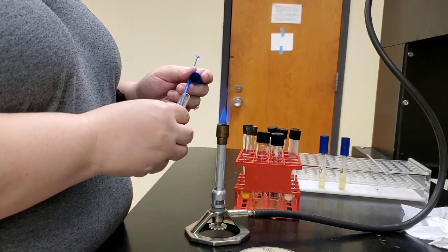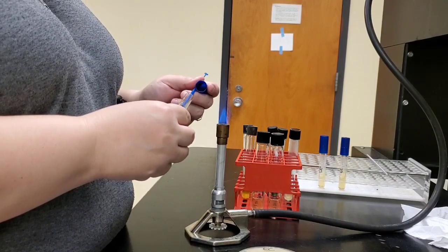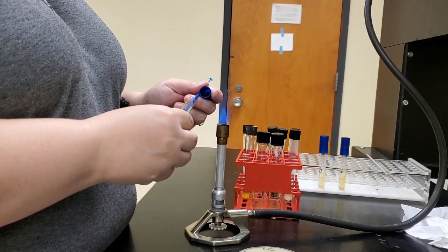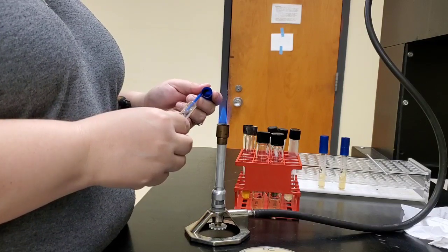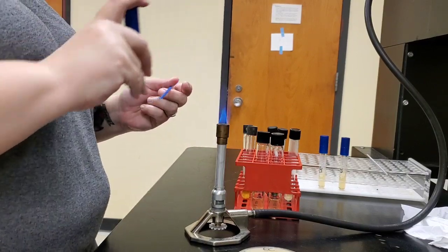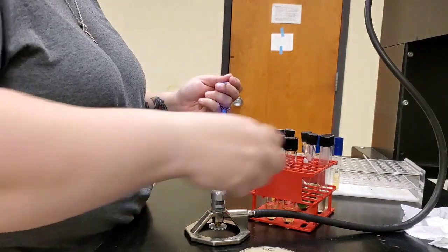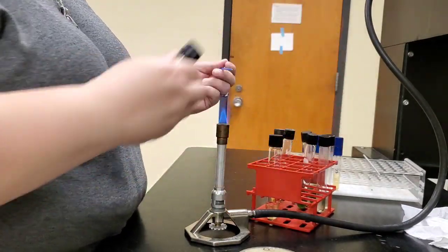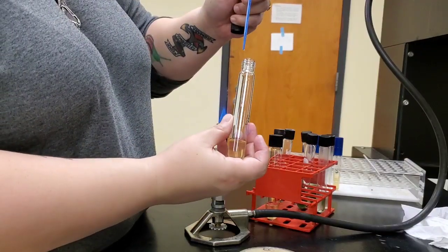We'll obtain some of the organism on the end of the inoculating needle. And we will stab into the nutrient gelatin medium.